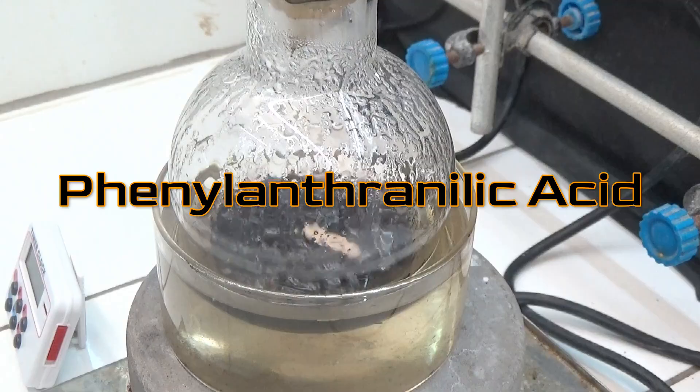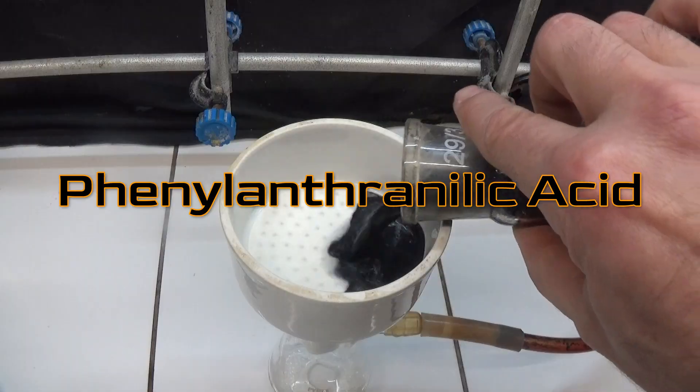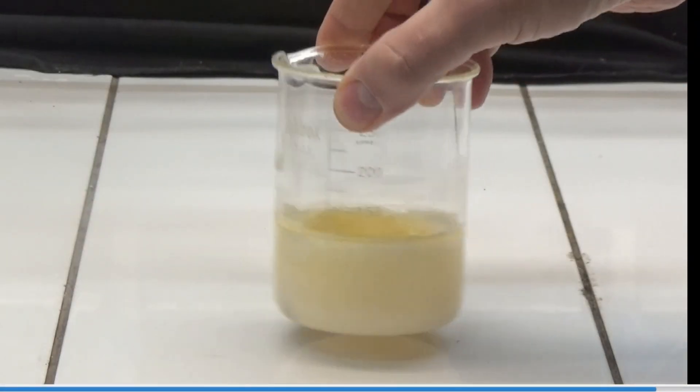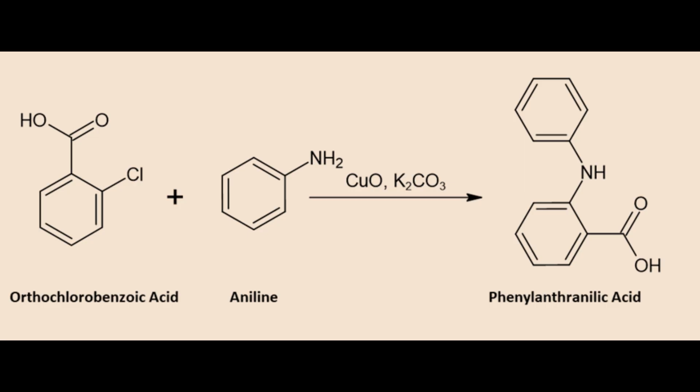This video shows how to synthesize phenylanthranilic acid. For this synthesis we will use orthochlorobenzoic acid synthesized in a previous video. Phenylanthranilic acid is formed by the action of aniline on orthochlorobenzoic acid using copper salts as a catalyst. This synthesis is known as the Ullman reaction.